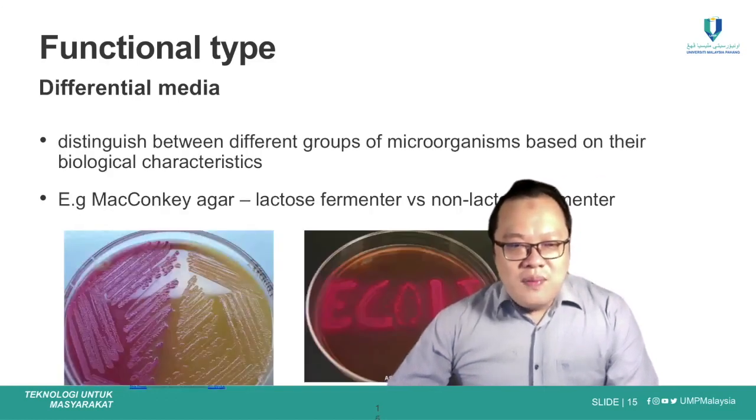MacConkey agar also can be a differential media. It can differentiate between the lactose fermenter and the non-lactose fermenter.